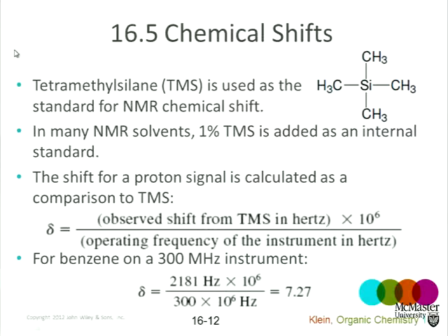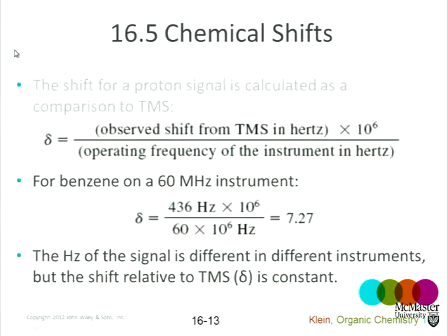So here is the chemical shift of benzene, 7.27, and in fact, that is caused by the structure of benzene. It's caused by the resonance of the electrons circulating around the ring that we saw earlier on. Those electrons influence the shift of the hydrogens on the carbons that are attached, make them move to 7 ppm. And likewise, other chemical effects influence proton chemical shifts.